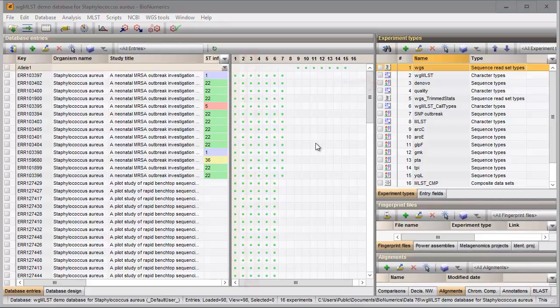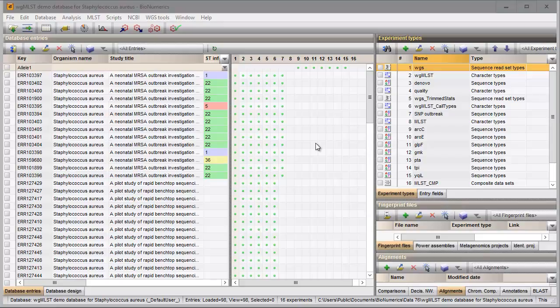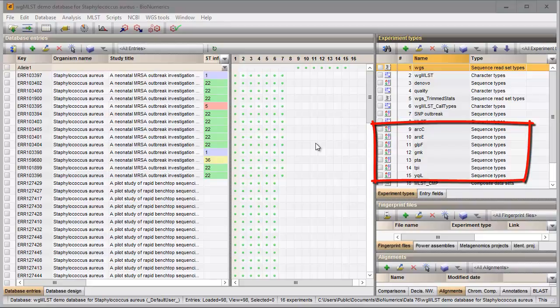We will look for the 7 housekeeping genes as used in the online MLST scheme hosted at mlst.net. The MLST online plugin is already installed in this demonstration database, resulting in a sequence experiment type for each housekeeping gene that is present in the online MLST scheme.